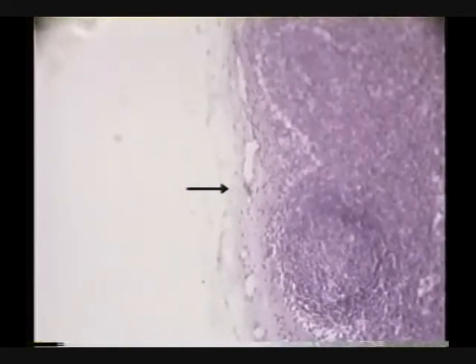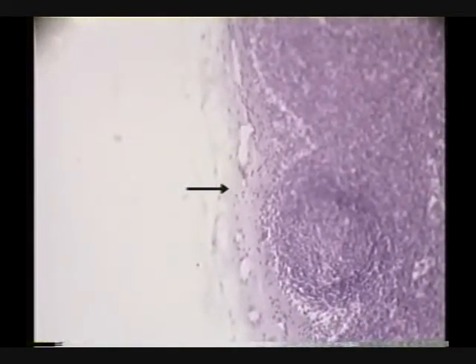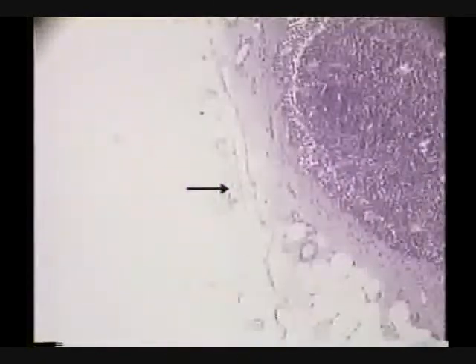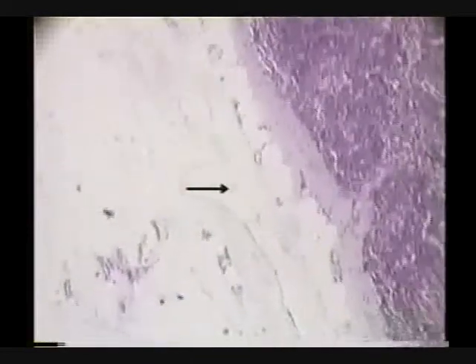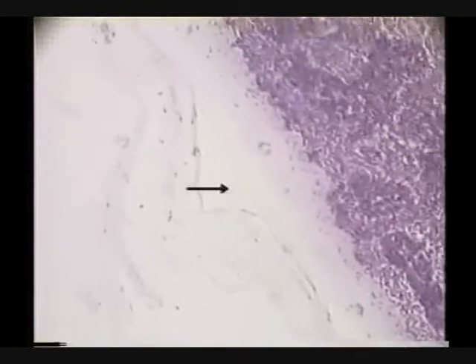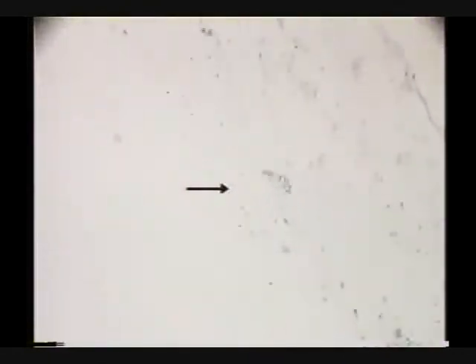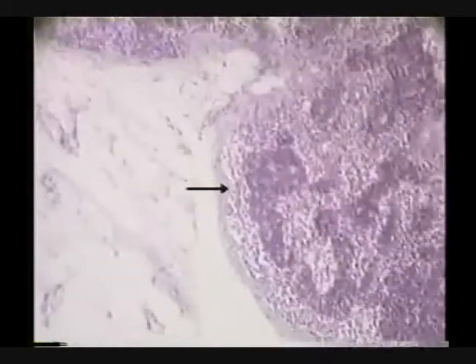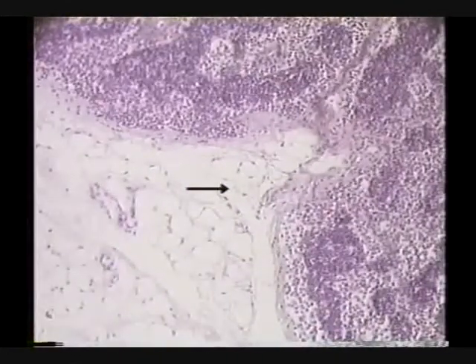Let's try another lymph node slide - this one looks like a different one. Immediately you can see a good capsule and lymphatic nodules and germinal centers - they jump right out. It's got a lot of adipose around it, and that certainly looks like a hilum - a nice big indentation coming in.